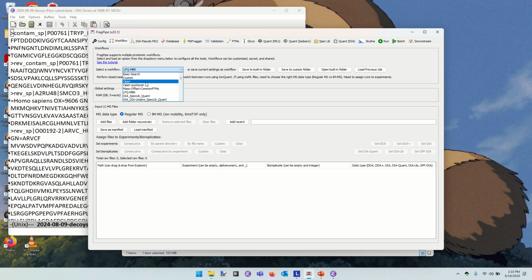Open PTM search is what you do when you don't know what mass shift is found on what amino acids. That's quite different than a phospho search. If I were doing a phosphoproteome, I would probably look for plus 80 because that's the mass change induced by phosphorylation, and I would look for it on serine, threonine, and tyrosine because those are the 3 places it can be found.